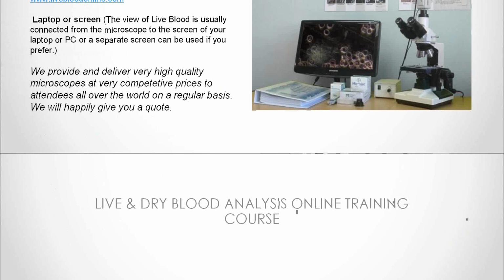Setting up equipment and costs. The equipment required: microscope, lighting, camera and screen.